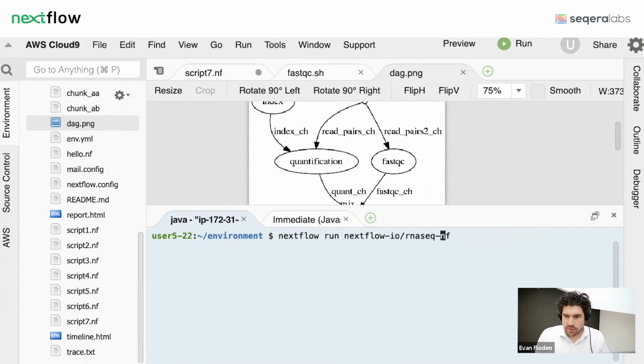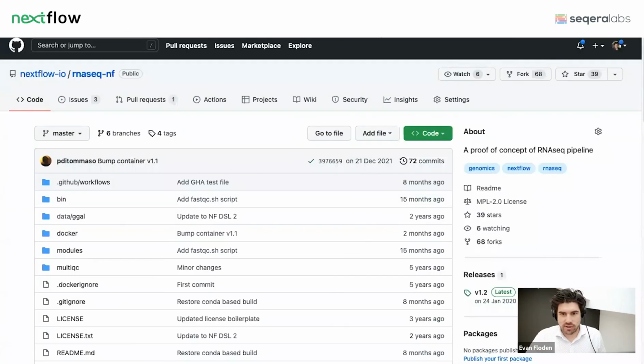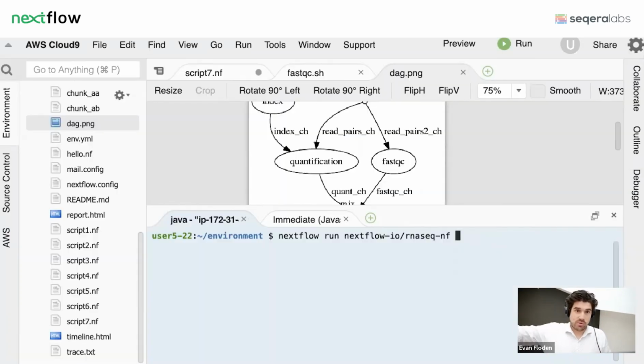When we launch this, we can also just say any options that you want. So now it's basically replaced the file with this repository, and it's going to be running from the project dir, the project directory is now this repository. So what happens is when we launch it, Nextflow goes to GitHub, in this case, makes a copy of the repository and stores it in a location, essentially the Nextflow assets, and then we can run it in this way.